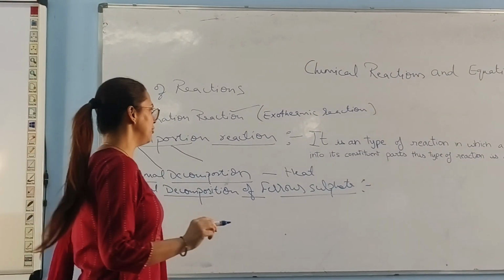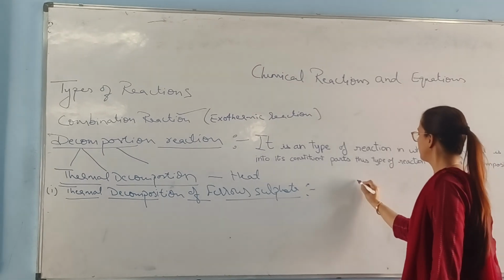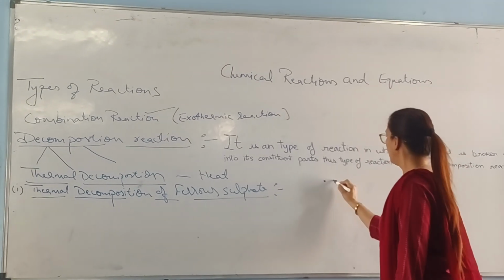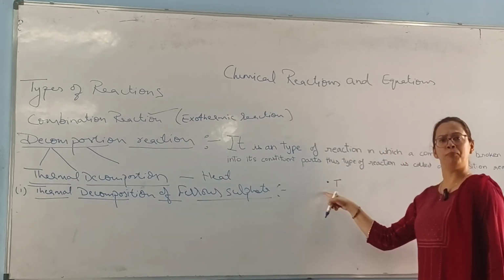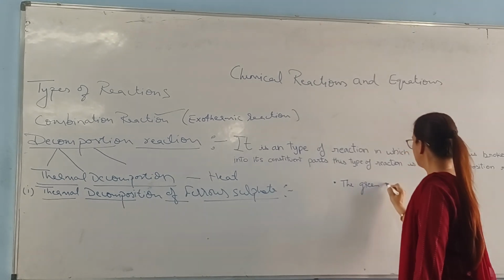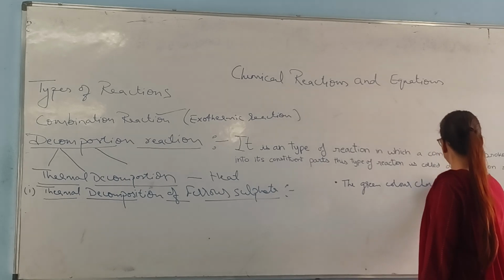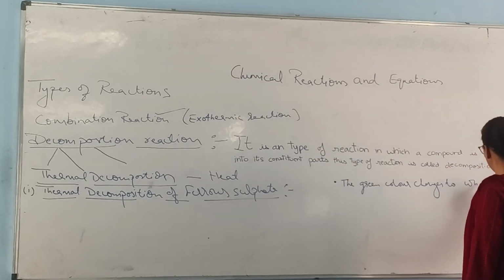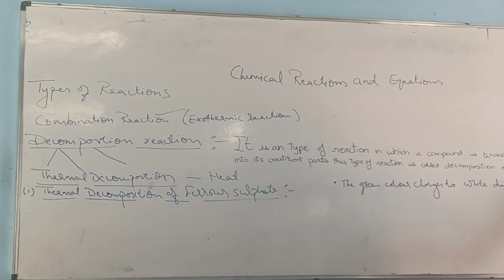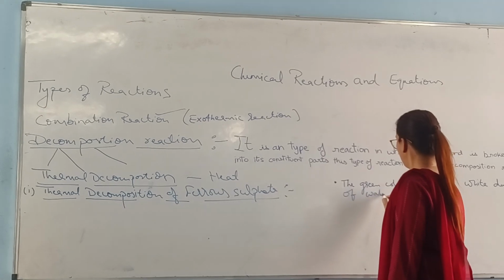When we heat ferrous sulfate, observation: in the first step, the green color changes to white first, due to loss of water.